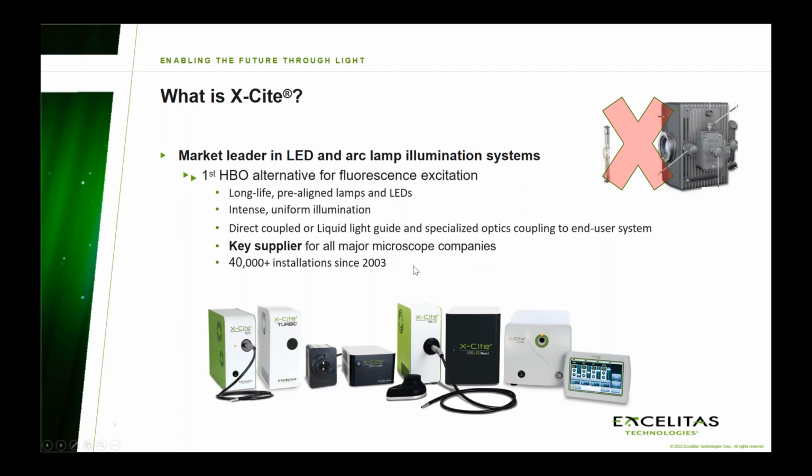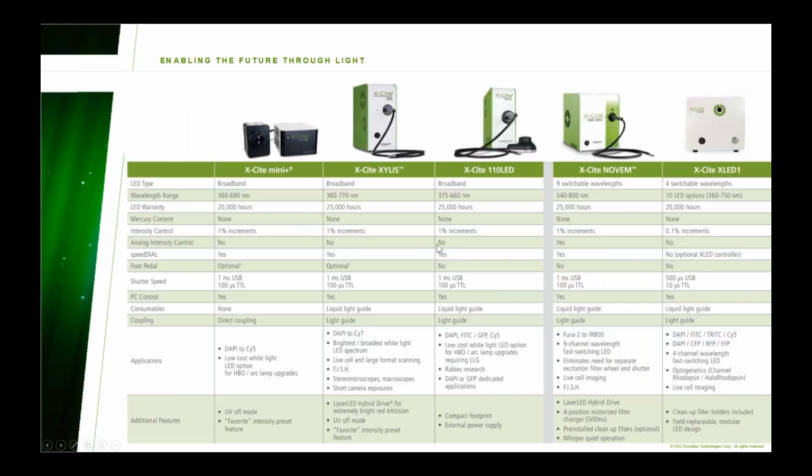Since then, obviously, we have moved on to LED technology. And just to cover the range of what's available in LED technology, there's essentially white light systems, and then there are switchable systems. And by white light, that means a broadband source where you would have to do the filtering in the actual microscope. In the switchable options, you would have filters built into the unit, and you would thereby be able to much quicker switch between the different wavelengths for slide scanning, for multiplex imaging, for high throughput screening.